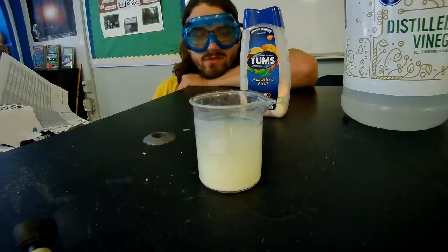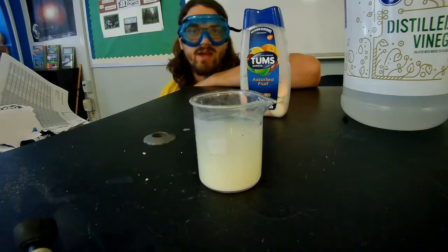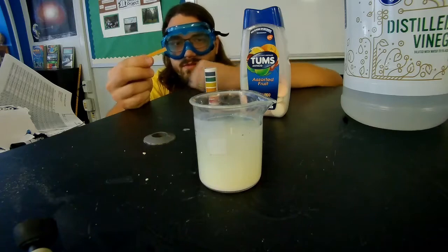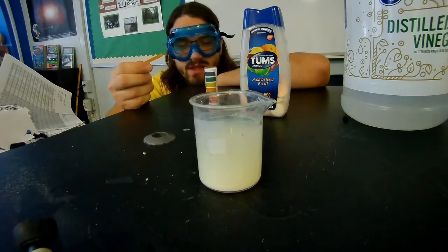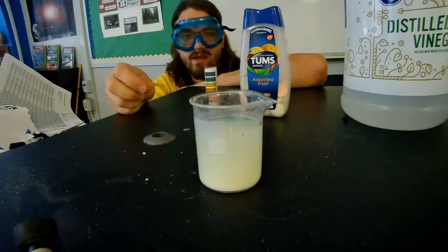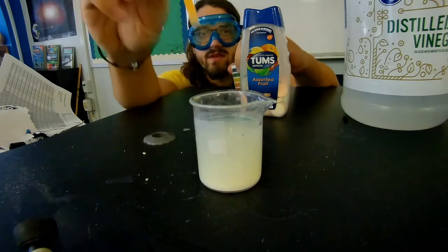All right, so that goes through our 8 chemicals that we have. And so now for determining the pH. And again, how that works is we use this stuff called pH strips. Sometimes it's called litmus paper, and all you have to do is dunk it in the substance and see what the color changes to. So that's what we're going to do here. Let's dunk.